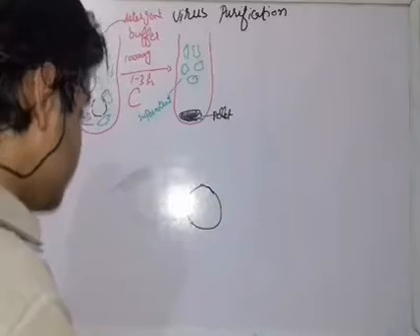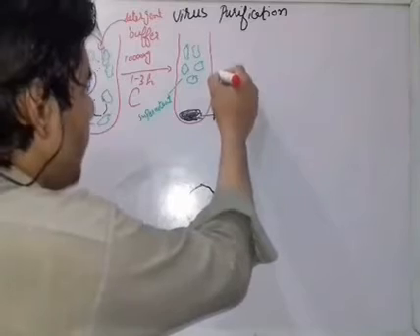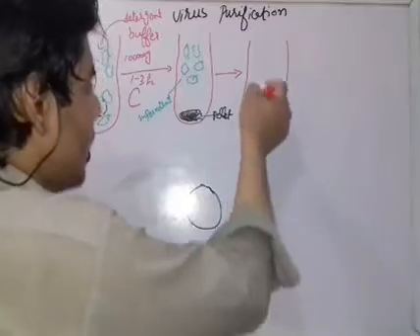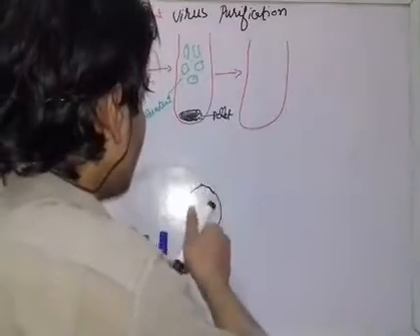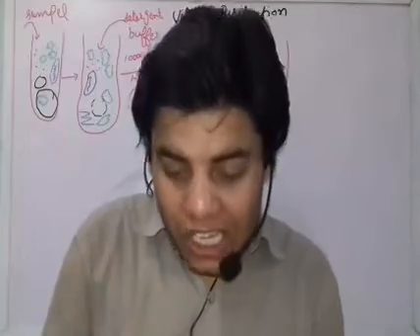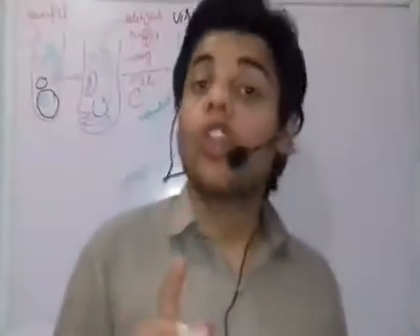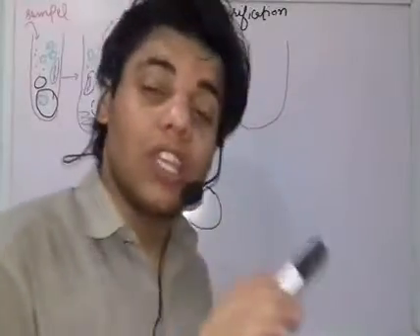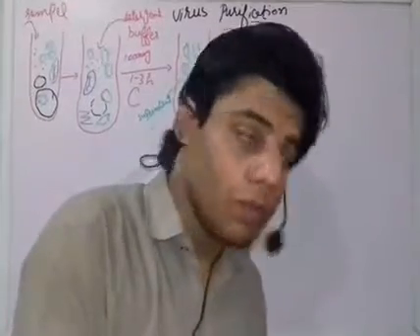Now let's suppose the supernatant is discarded, so within these tubes there is the pellet. The pellet contains cell content, organelles, and active viruses. Active viruses means complete viruses, or the viruses which cause the infection inside the host cell. Now these viruses we need for our further procedure or further test. Fine. So we need these viruses.